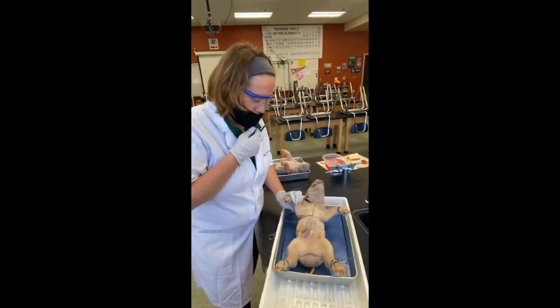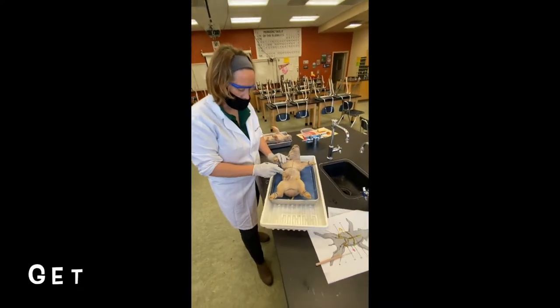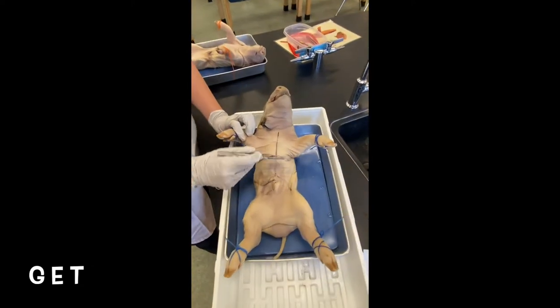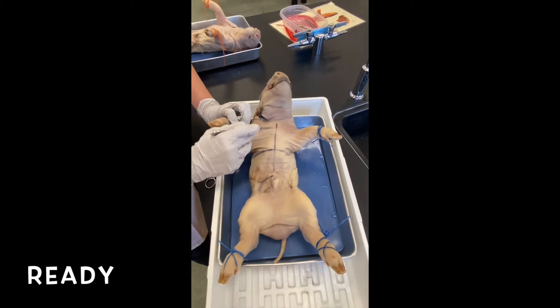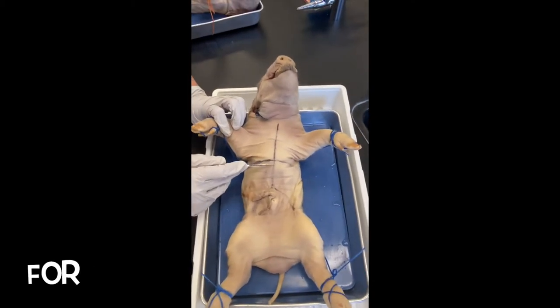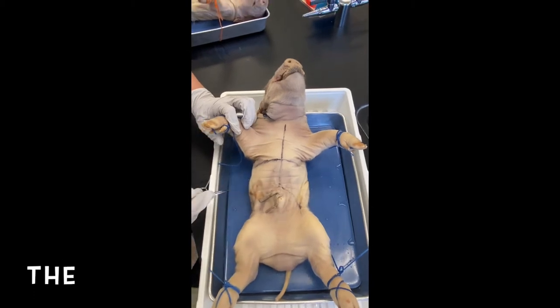So here we go for the actual cuts that are going to be made. I've marked it all for you. This is where the diaphragm is in this area. So this will be the chest or thoracic cavity, and then this is all going to be our abdomen from here down. And then we'll cut here around the umbilical cord.